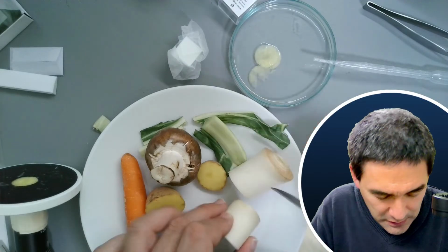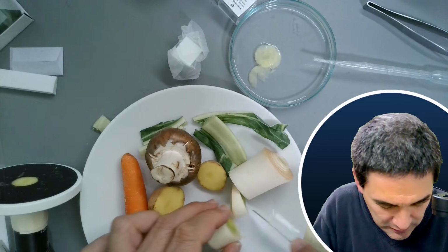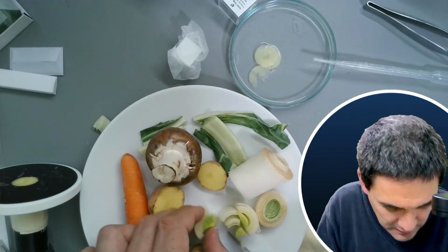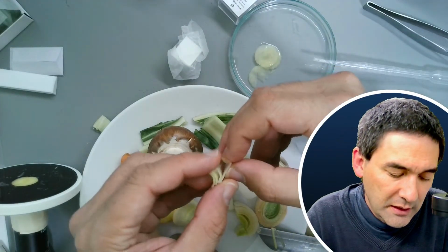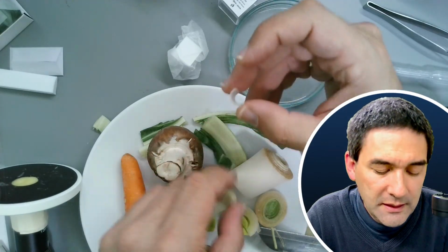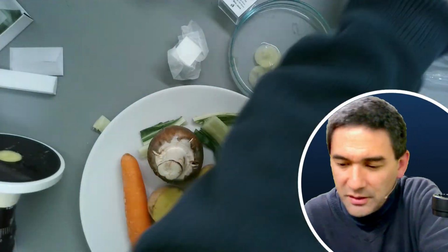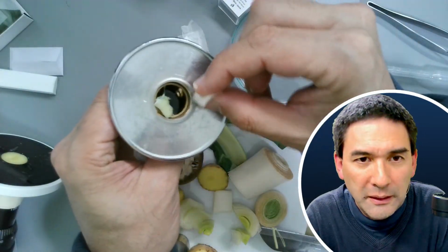Okay, so here it's a little bit more fresh. I'm just going to maybe cut it like this. And let's say that I want to get a cross section of this here. This is way too thin, really, to put it in here. You won't be able to properly clamp it down.